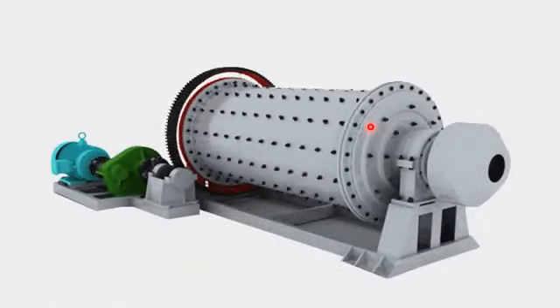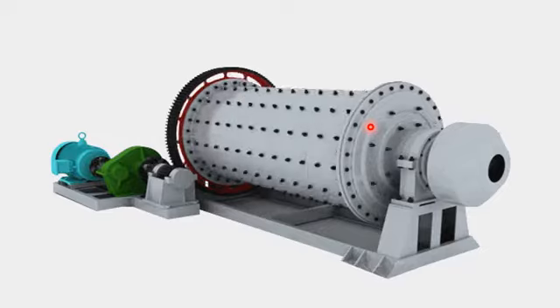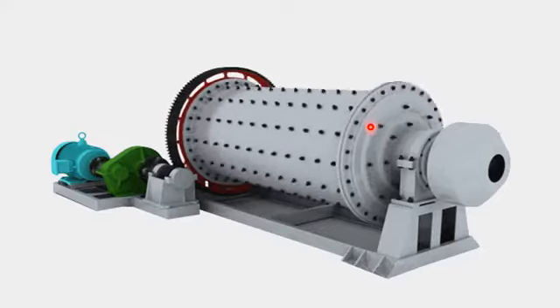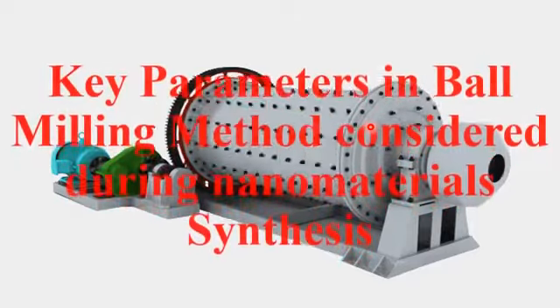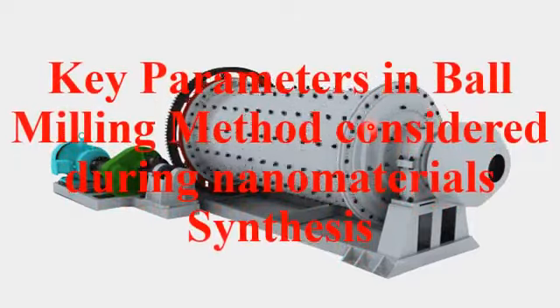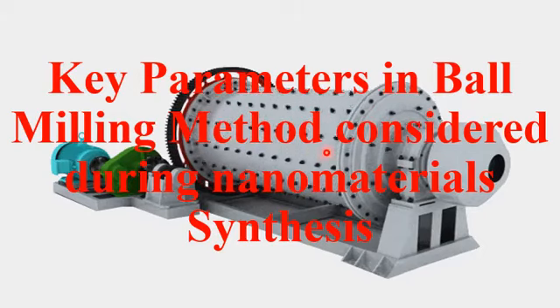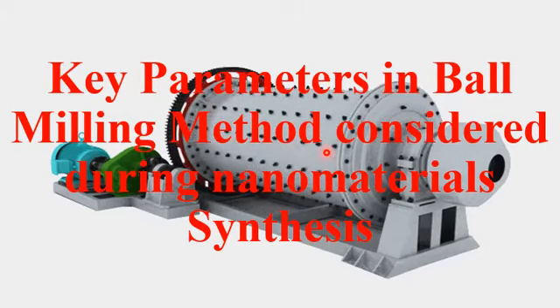Dear students, please note that it is very important to consider the physical parameters or key parameters which are required in the ball milling process for synthesis of nanomaterials.